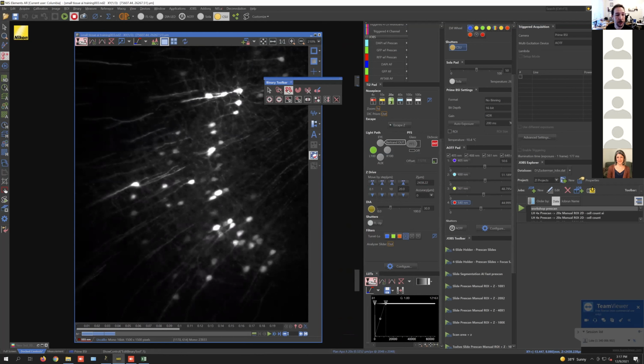But just so you can see what this looks like, if I click on a cell with this multi-region selection, it will try and find all the cells of a similar intensity. This is not going to be so good because you can see we're already introducing some false positives. I would actually spend the time to carefully annotate this, because what you get out of the network is as good as what you train it with. And so if you start to include pixels that aren't really cell bodies in the training, you're going to have those kind of things appearing in the output.